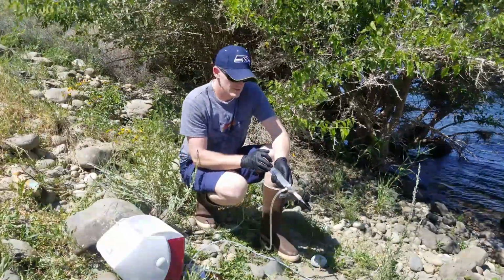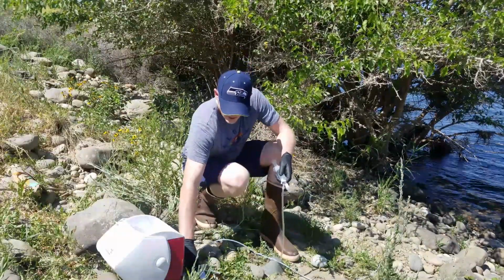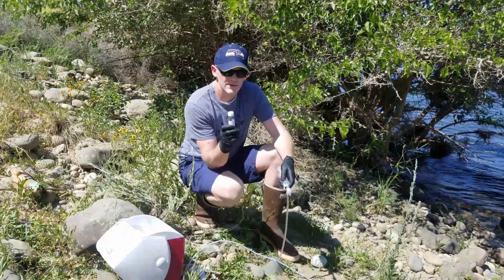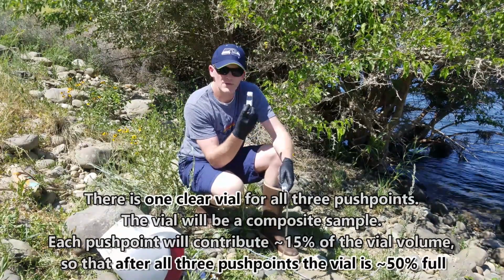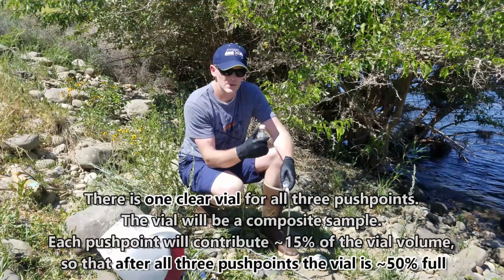As before, push a few mils through the syringe just to flush it. Next thing you're going to do is put a few mils into the clear vial. Now here, we're going to do a composite sample. So we're going to get one half-full clear vial from a small volume collectively across all three push points.